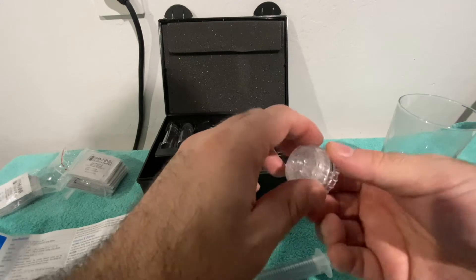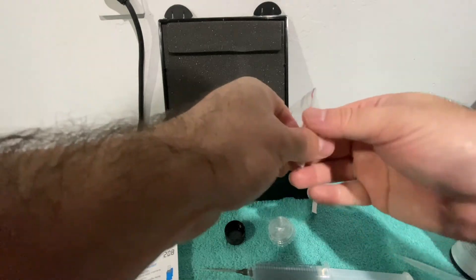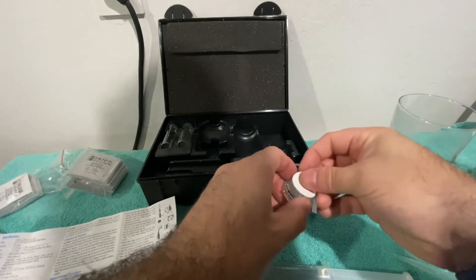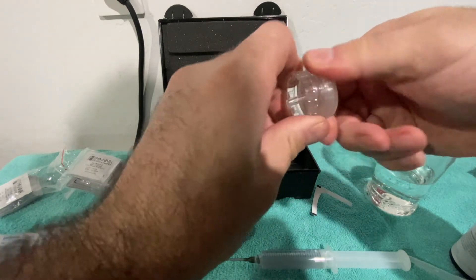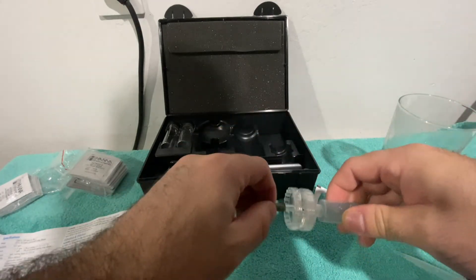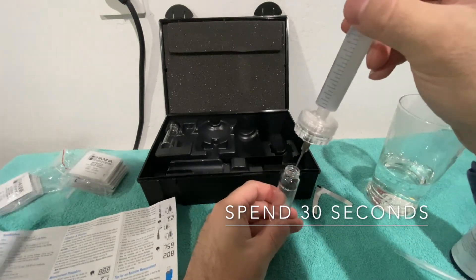Next, take the filter housing — untwist it, and on the side that doesn't have a little O-ring, place one of the filters in. Put the cap back on top and twist it on. Then remove the needle, twist the filter housing onto the syringe, and put the needle back on so the liquid goes through the filter. Get a cuvette out and very slowly push the liquid through.